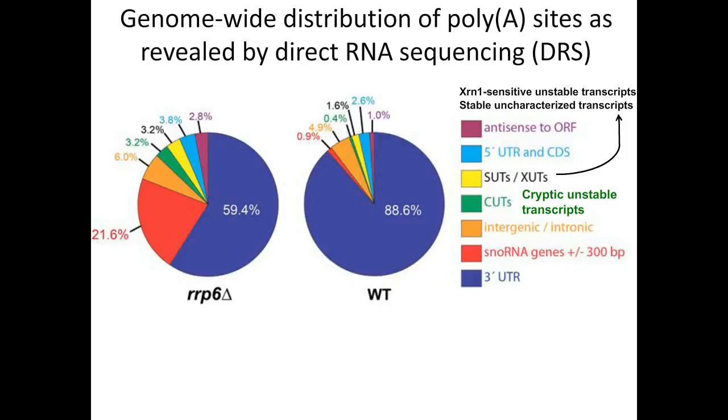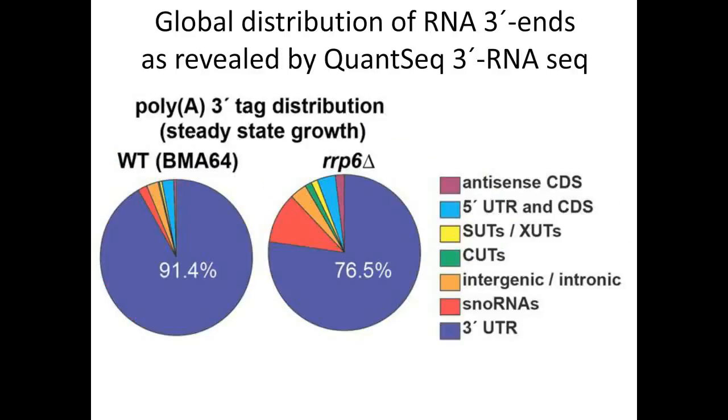So we figured that this was an effective approach for understanding the nuclear exosome targets, and we wanted to compare it to the QuantSeq method. So here's a comparison of the exact same RNA samples sequenced on the QuantSeq platform. And you can see that we get a larger fraction of reads mapping to the 3' UTRs, and the relative ratios of the other categories are similar.